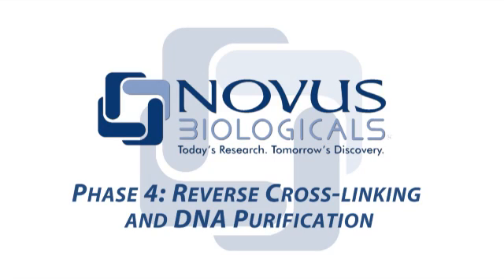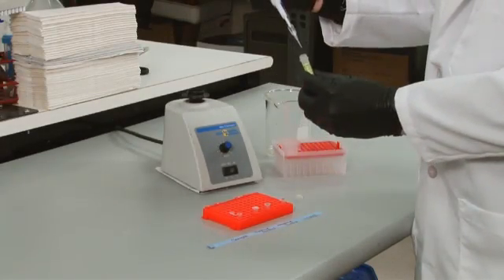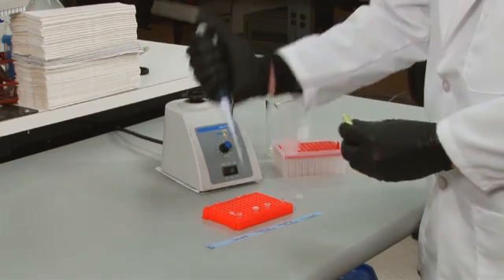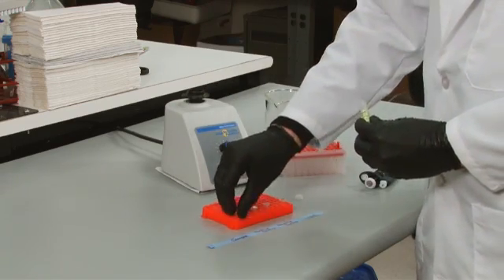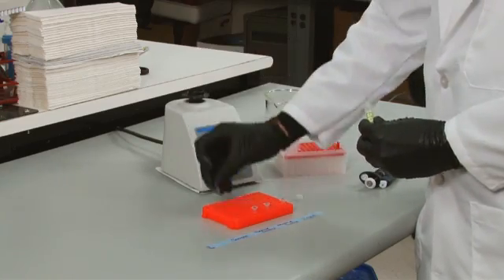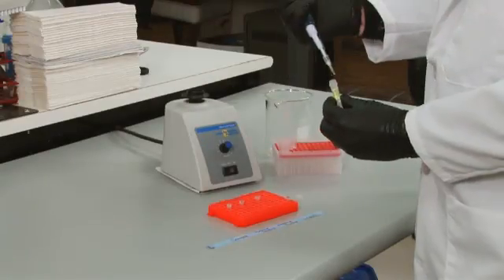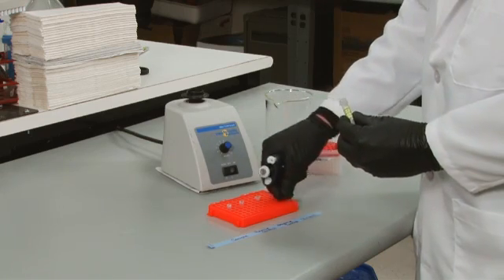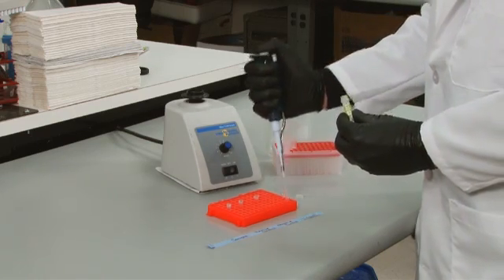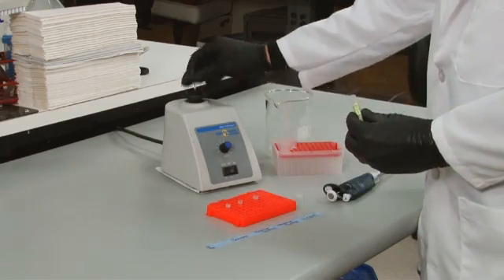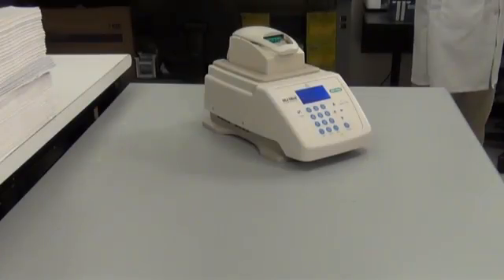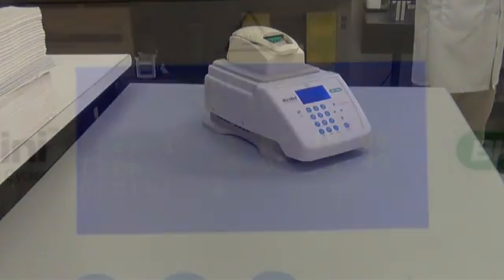In phase 4, we will reverse our initial cross-linking of proteins to DNA, followed by purification of the DNA. Start by taking each IP sample, as well as the input sample which did not go through the preceding IP steps, and add 8 microliters of 5 molar sodium chloride to the 200 microliter samples, followed by vortexing. Incubate at 95 degrees Celsius for 15 minutes.